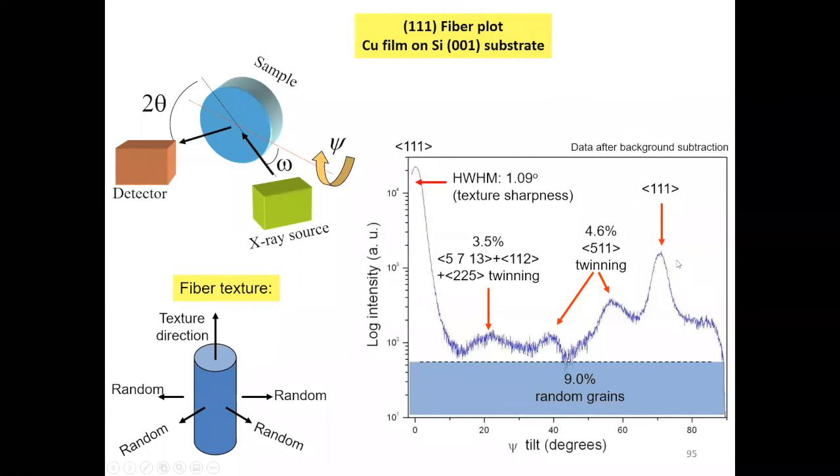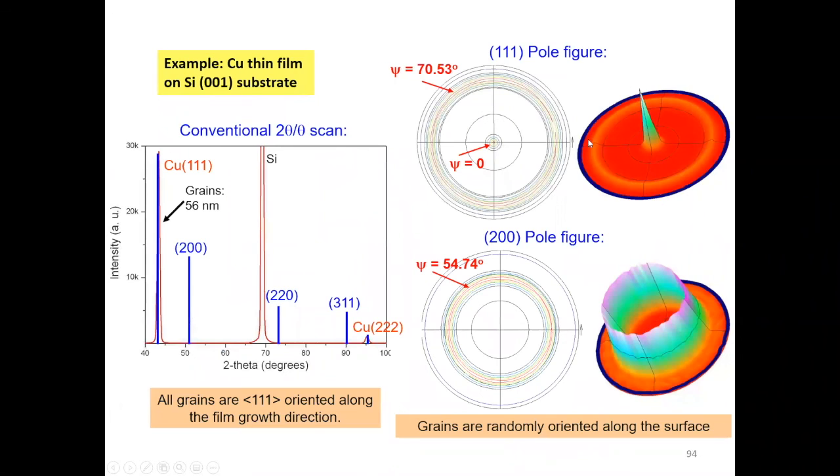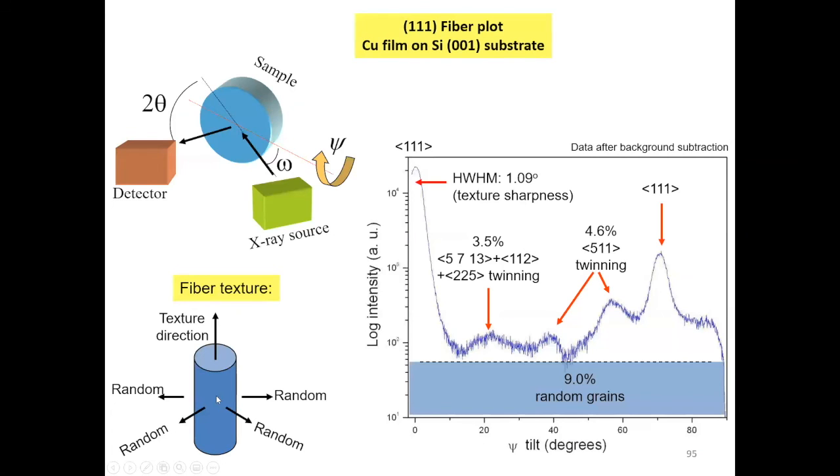And basically, I think you got the image there, the message there, that if you start dealing with more oriented stuff, you have to start using pole figure. There are different methods listed here where the scans are more sophisticated, and you have to use an instrument with better capability. Now, additional scan modes is very common, especially in the thin film community.